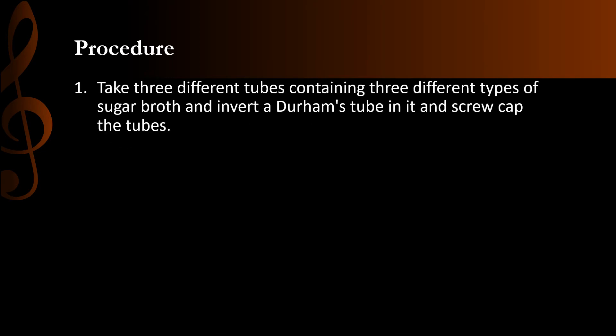The procedure: take three different tubes containing three different types of sugar broth and invert a Durham's tube in each, then screw cap the tubes. Label the three tubes. The Durham's tube should be inverted such that there is no air bubble in it — this is a very important point. If there is any air bubble, you will get false results. So check carefully that there is no air bubble in the Durham's tube, then screw cap the tubes. The three sugar broth tubes are then sterilized by autoclaving.